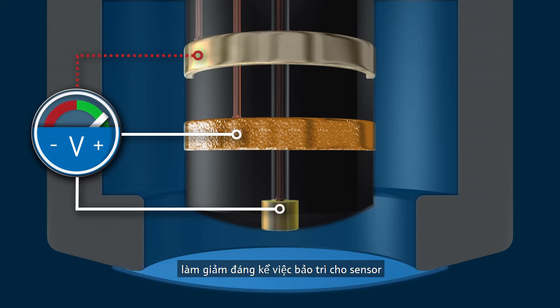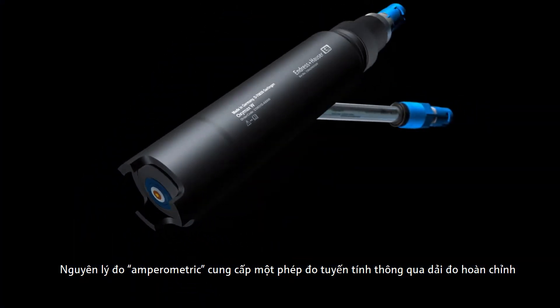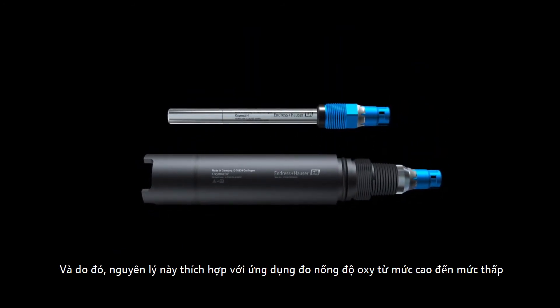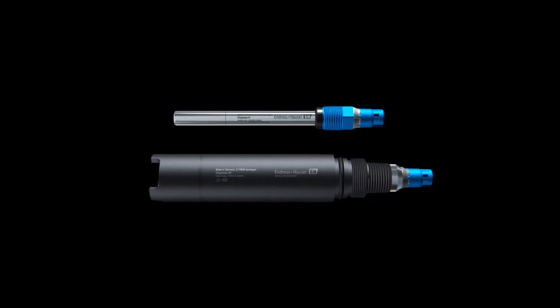The amperometric measuring principle offers a linear measurement via the complete measuring range and is thus suitable for high and low partial oxygen pressures and concentrations down to trace level.